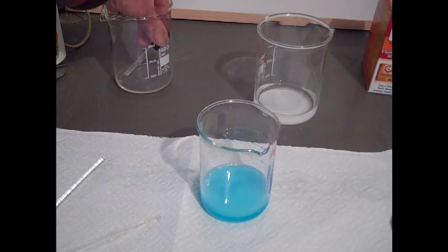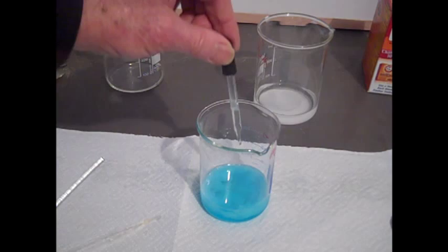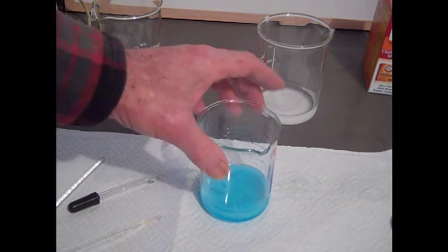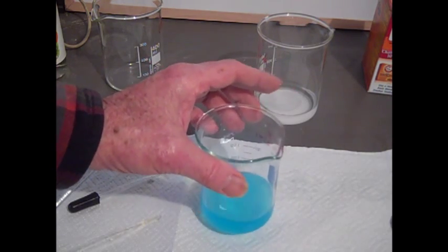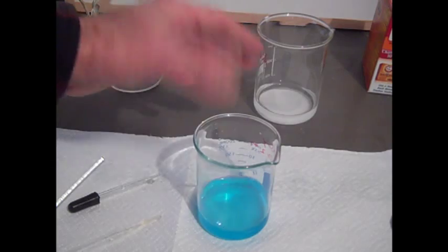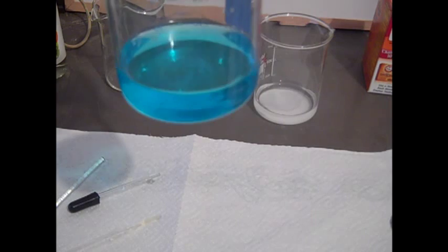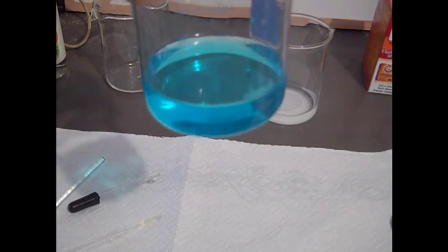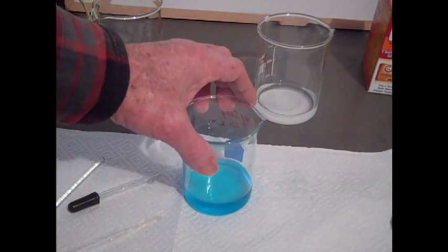Now I'm going to add the vinegar. A little bit. I can see it clearing up at the top. A little bit more. Now what's happening, and I'll swirl it a bit, I can still see some cloud of copper carbonate in there. It's just about disappeared. And you can see that it's clear again. We actually did this yesterday, and we were using used copper sulfate. But it serves the purpose.